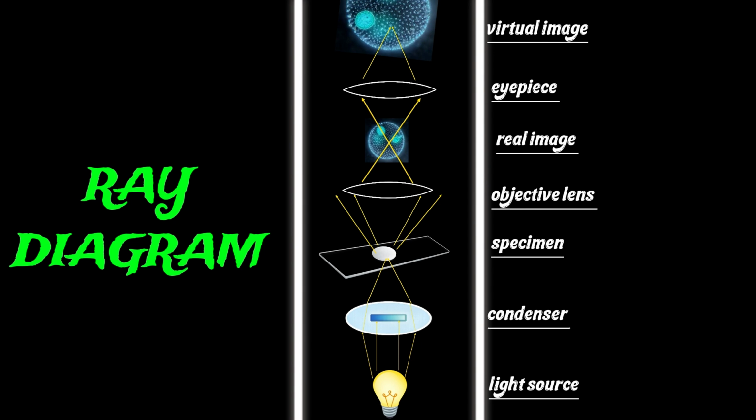Because the direct transmitted light never enters the objective, the background remains black. Only the light reflected, refracted, and scattered by the specimen contributes to image formation, causing the specimen to appear bright against the dark background. This simple modification in the path of light completely changes the appearance of the image.